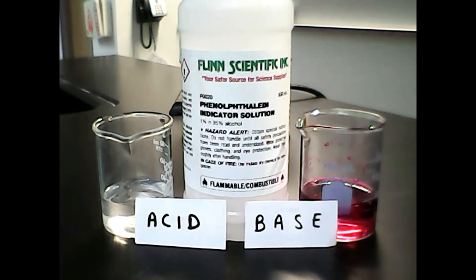Next thing we're going to need is something called an indicator. All an indicator does is tell us whether our solution is acidic or basic. It does that by changing color. You can see here that when our solution is acidic, it's perfectly clear. When our solution is basic, it's this deep pink color.